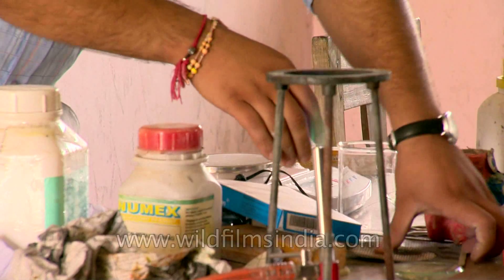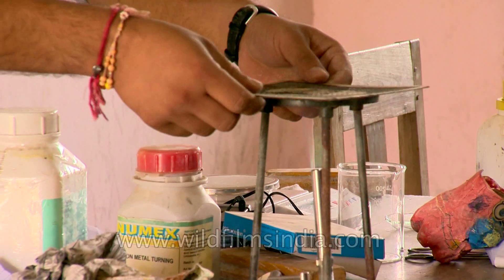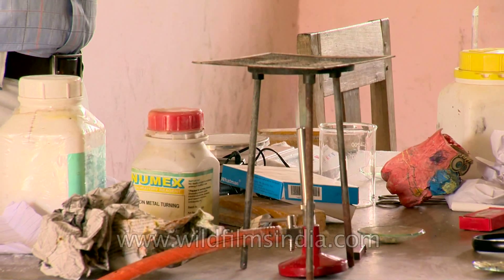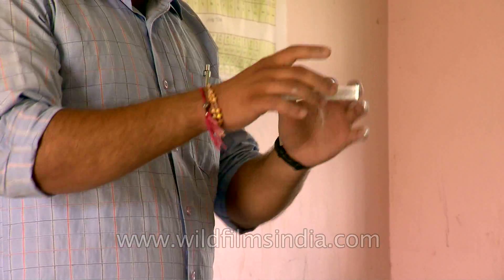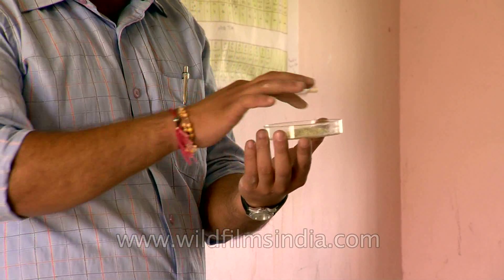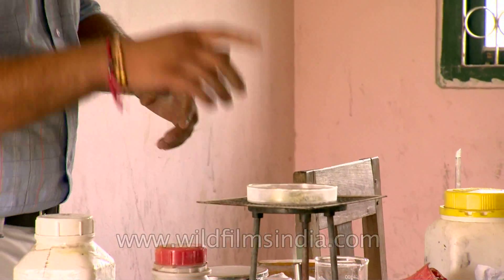We will be taking a wire gauge — this is called the wire gauge — so that we are able to control the heat by putting this one. Then we will be taking the mixture of iron and sulfur, which has been taken in the petrodish: seven grams of iron plus four to five grams of sulfur, in order to make the mixture.